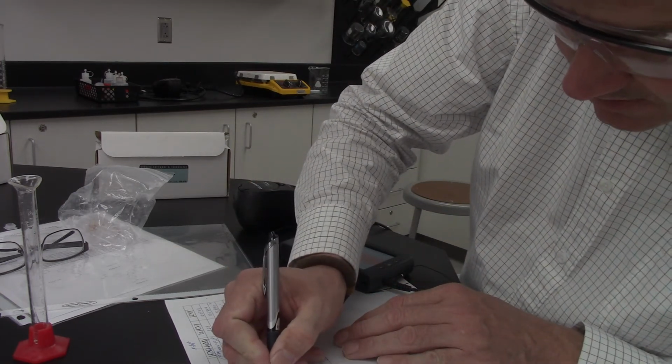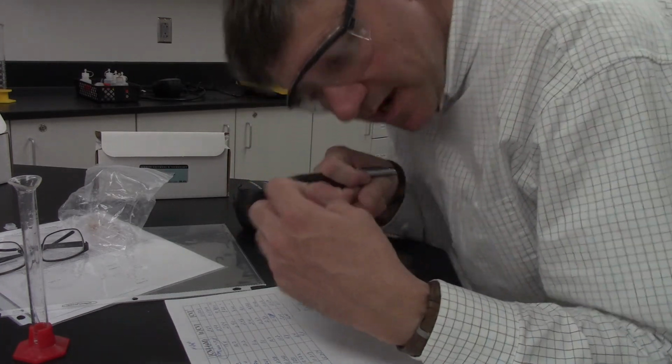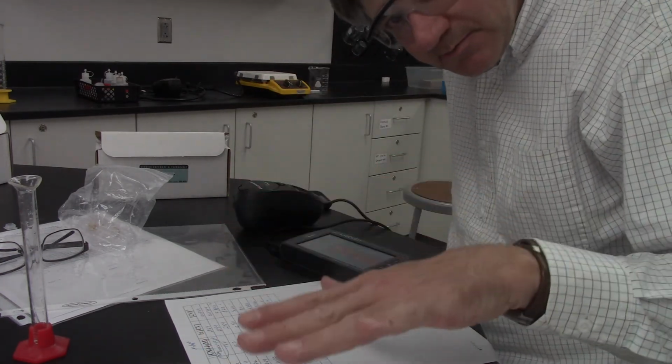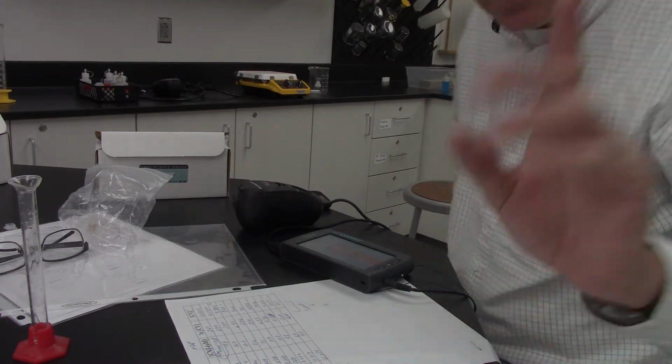Okay? So here's the deal. The sodium hydroxide is reacting with the crystal violet. The concentration of the crystal violet is dropping. Our absorbance is going down because the solution is becoming more and more dilute. So that's the story.